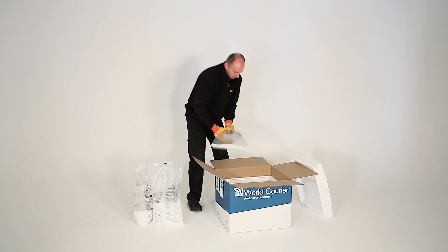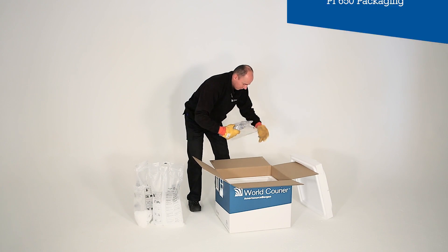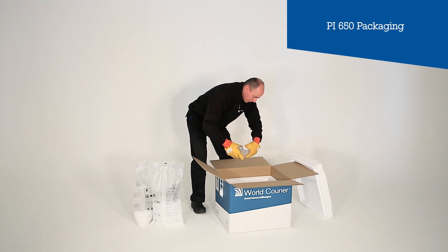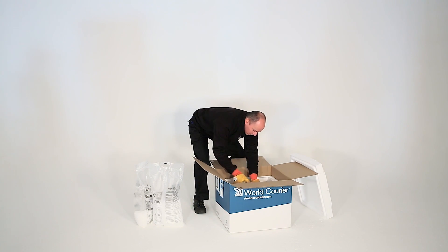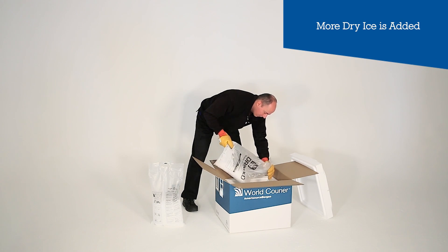Before placing patient samples inside the box, we ensure they're packed by the shipper into Packing Instructions 650 compliant packaging, including absorbent material. We then fill up the entire box with a second layer of dry ice.